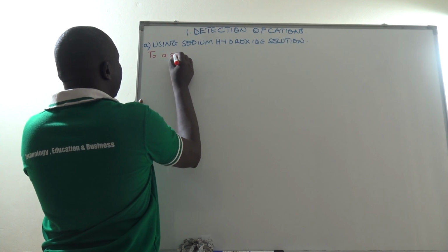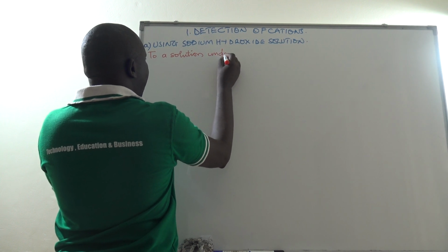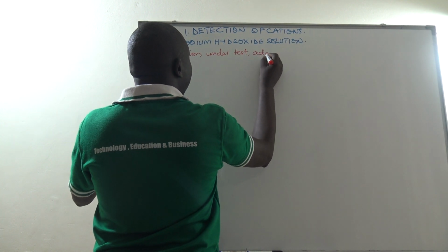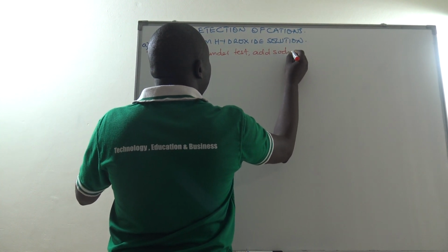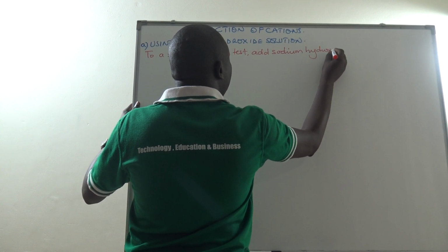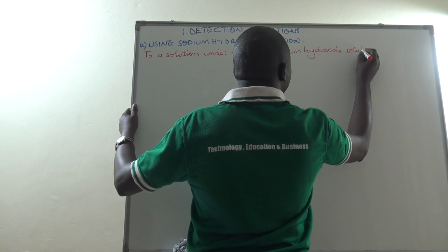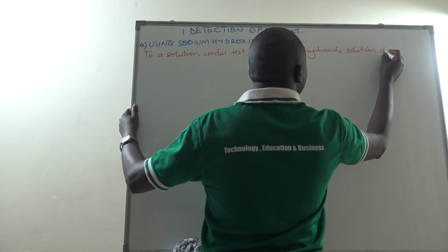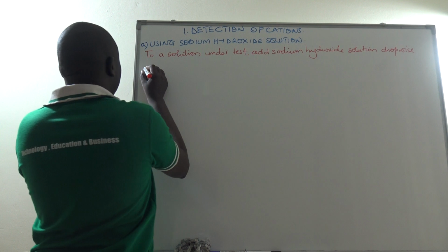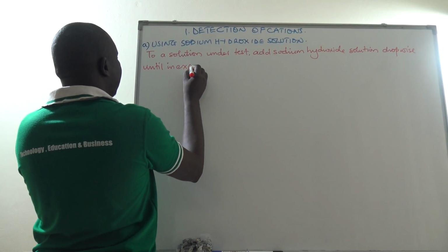To a solution under test, add sodium hydroxide solution dropwise until in excess.